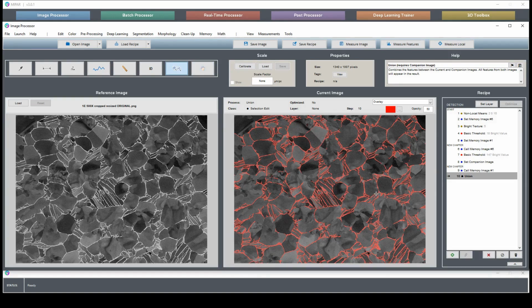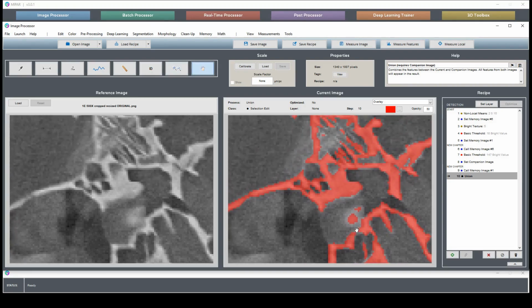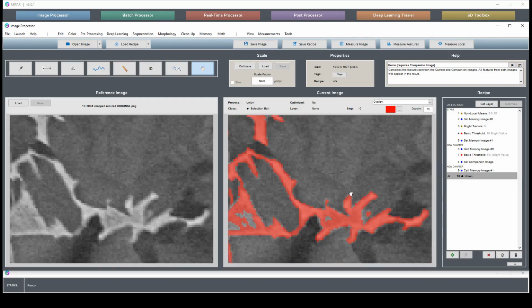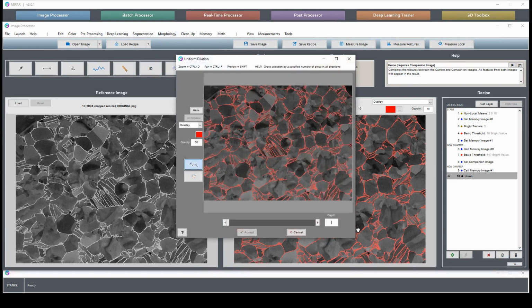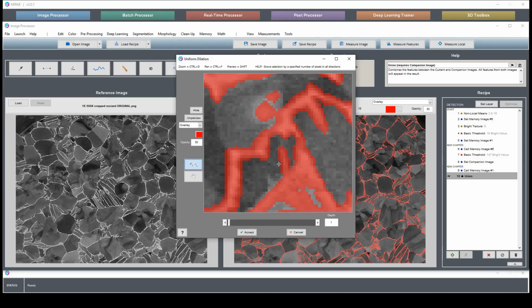So rather than just subtracting pixel by pixel, we can do a reject features, rejecting entire features based on their intensity mean. Now, before we do this rejection, though, we should notice that some of these finer pieces of darker beta aren't quite connected up the way they should be. So we'll need to remedy that before we can do our reject features. And we'll do that with just a simple dilation. If we dilate by 1 pixel, we can get some of these joins to happen.